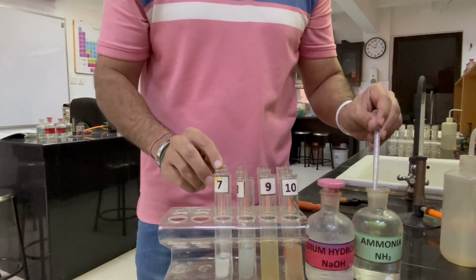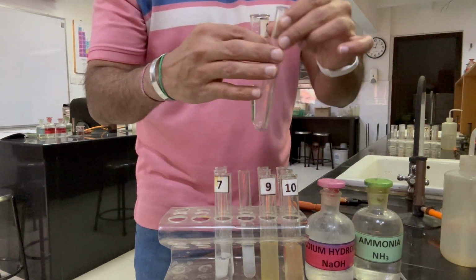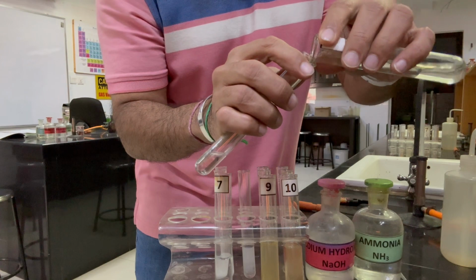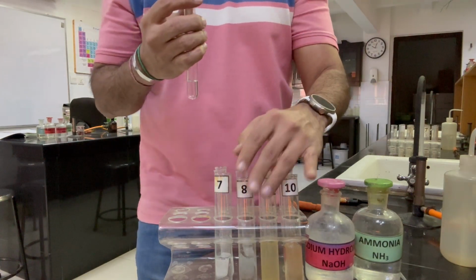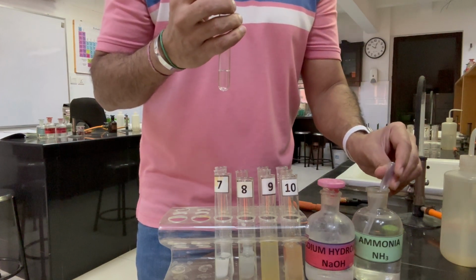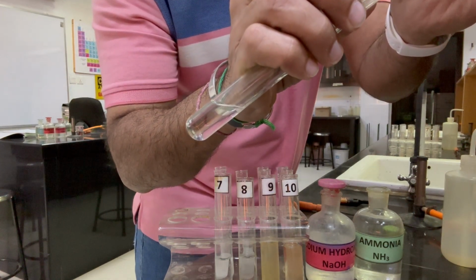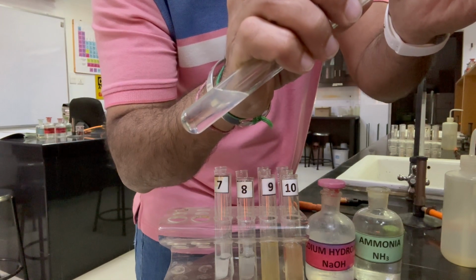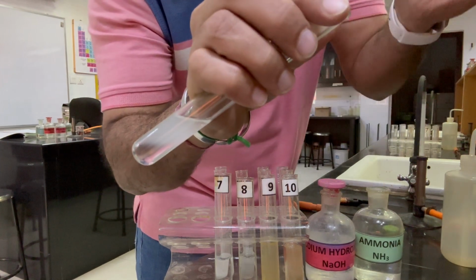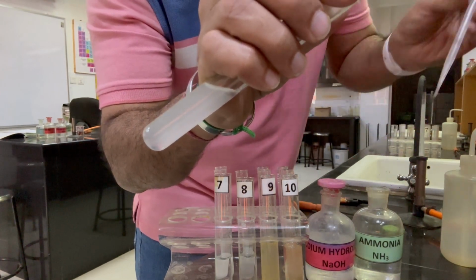Now let's move on to the Fa8, 1 centimeter depth. Again, a few drops followed by excess. So as soon as we add a few drops, white precipitates start appearing, and if we add in excess, those white precipitates are not dissolving.